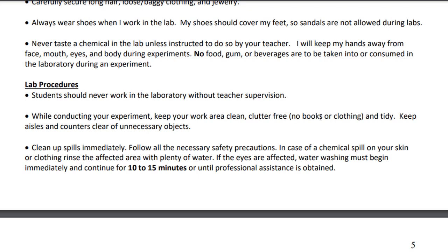And you don't want any textbooks or anything sitting on a lab bench just in case something spills. Or maybe you just turn on the tap and the tap sprays some water somewhere. You don't want to be wrecking your books. So your binders or my textbooks, you don't want to be wrecking those. So only keep exactly what you need at the workbench, which will usually just be the handout that I give you. I usually give you a separate lab handout, so in case anything goes wrong with it, you don't ruin your whole notebooklet. Anything that spills, we clean up right away.